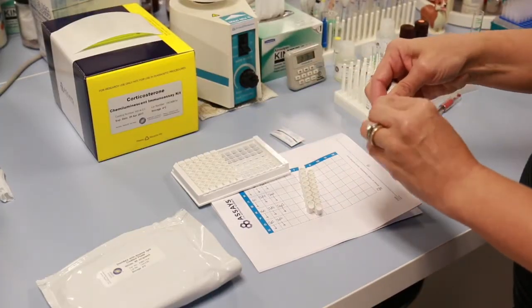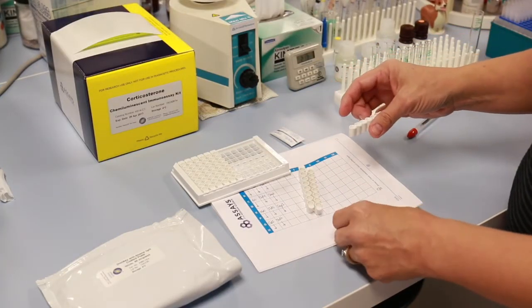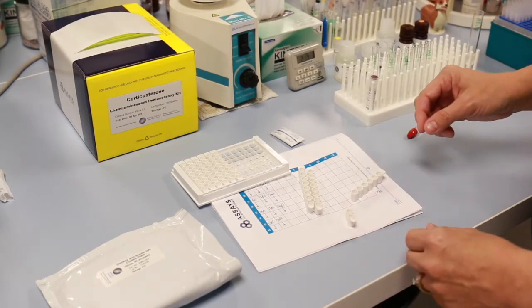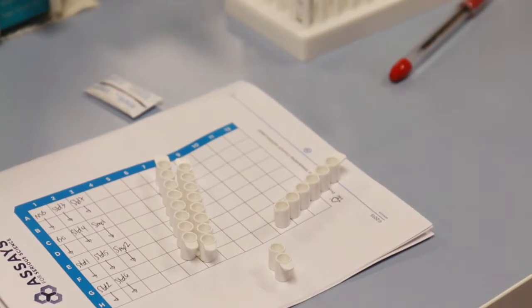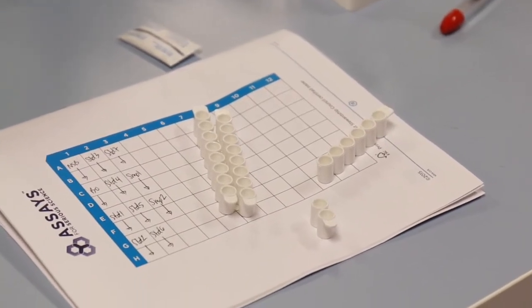Most of our EIA kits utilize strip well plates. After using a kit, it is a good idea to wash out and keep some of the strips.